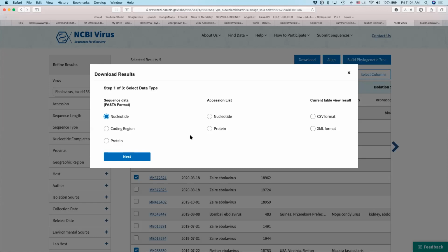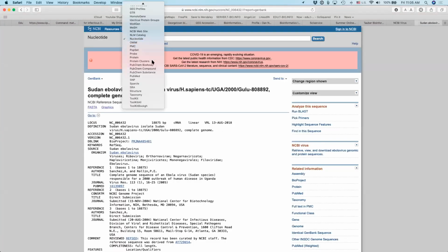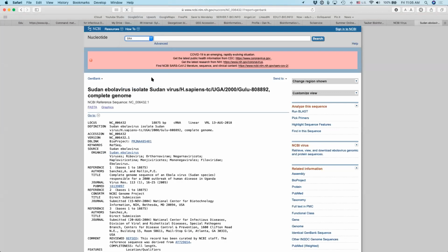All right, great. In the meantime, if you are just trying to map a data set onto a reference genome and do a sample RNA-seq analysis, I suggest using a publicly available data set, just like what we did on NCBI, looking at some of your data that might be similar. Here, for example, you might go to SRA, which will contain those raw FASTQ files, and then you can create a project or think about a project.